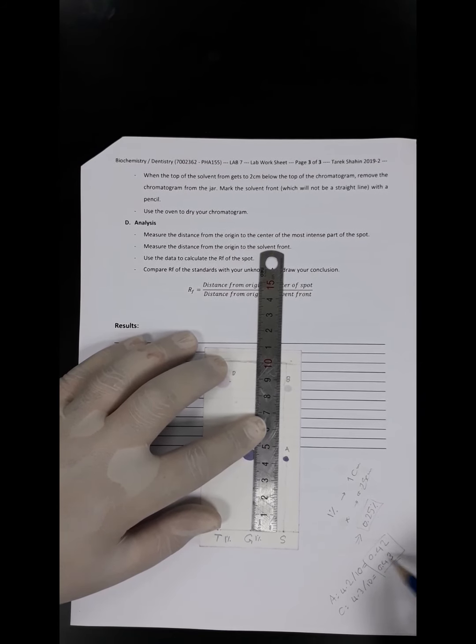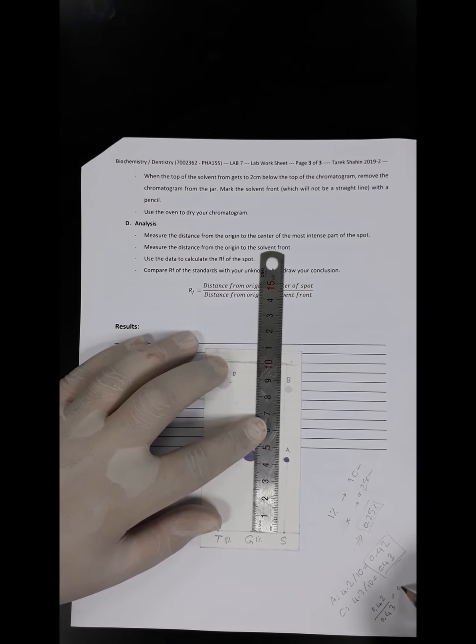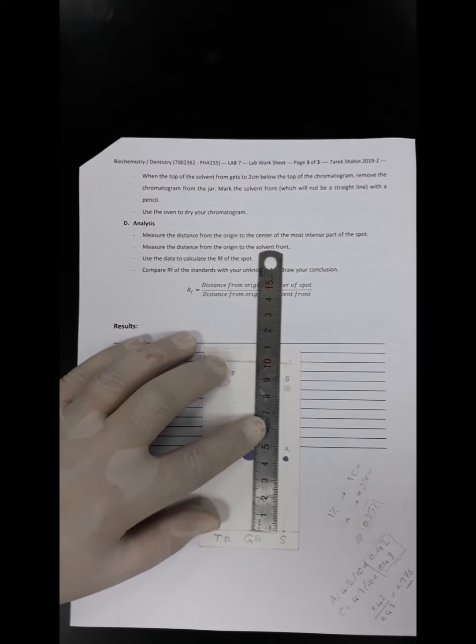If we divide them, 0.42 divided by 0.43, it will equal 0.976. This number is very close to 1. So we will say that spot A and spot C are identical to each other.